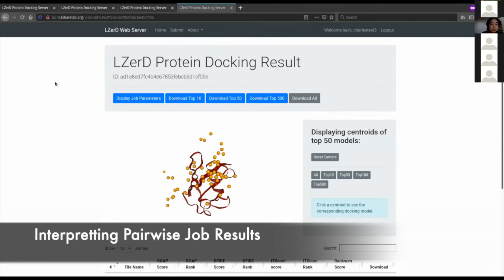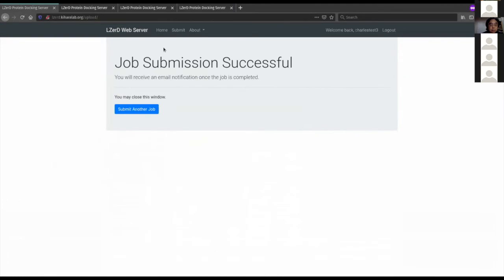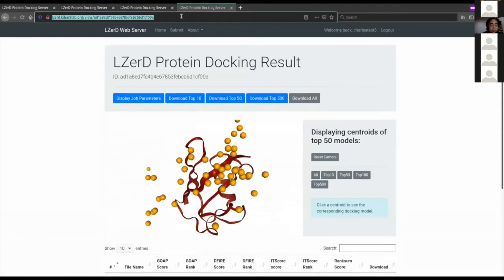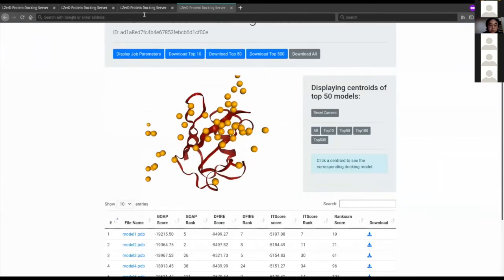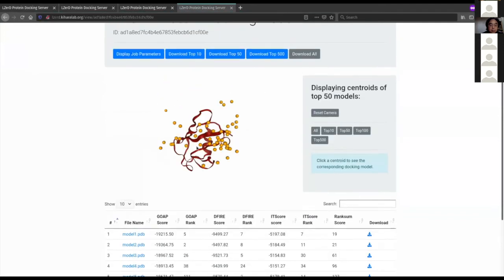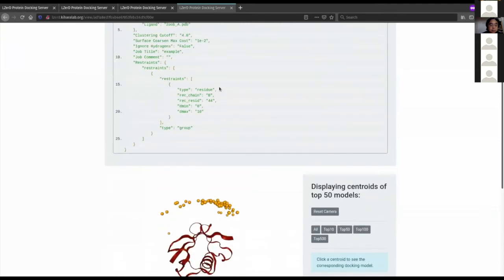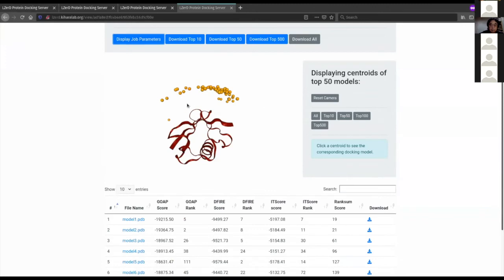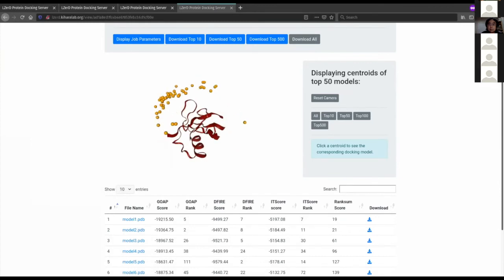I've loaded in this job. You can either do the same procedure I just did by submitting the example job, or follow a link I've put in the Zoom chat. On the results page, there is a summary visualization of the docking run. This docking run had one receptor binding site restraint specifying that residue 44 should be within 10 Angstroms of the ligand. The receptor protein is shown in red, and the orange dots each represent the centroid of a docked ligand position.